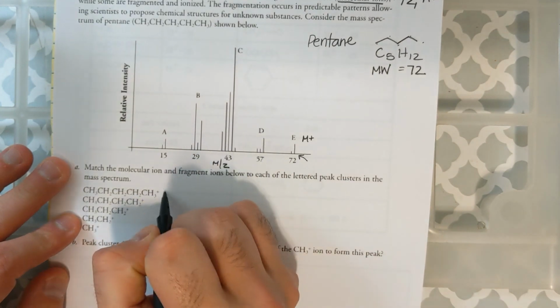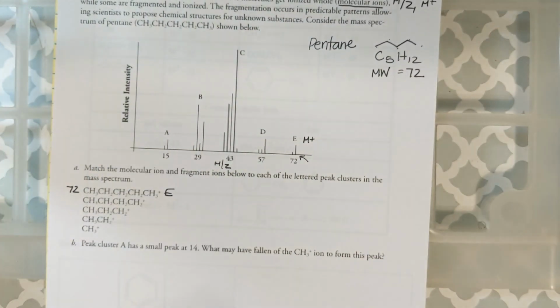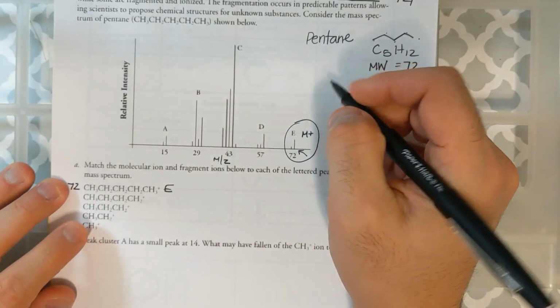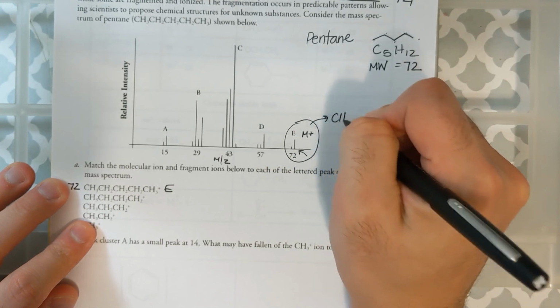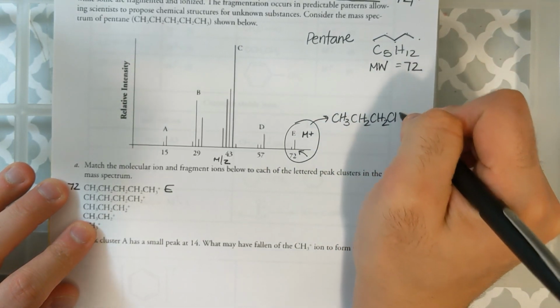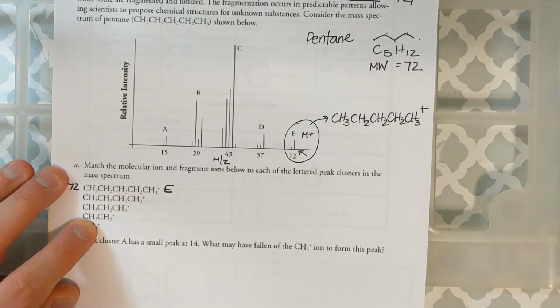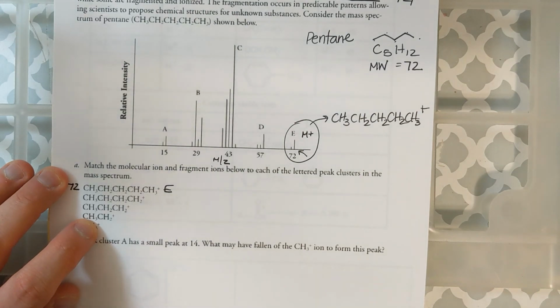This top one is going to be E. This has a mass of 72. And so this peak right now is CH3, CH2, CH2, CH2, CH3, but with a positive charge. And this is my M plus peak.